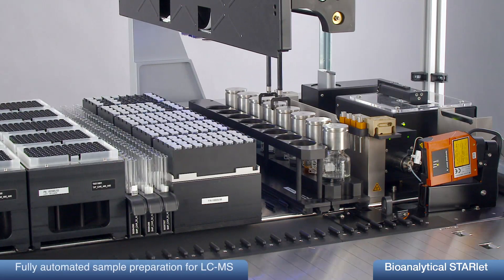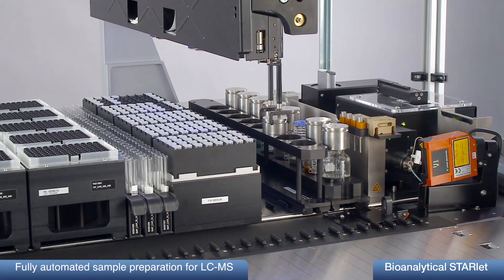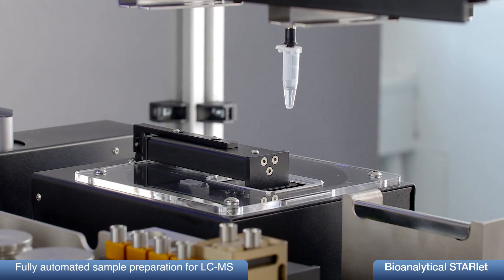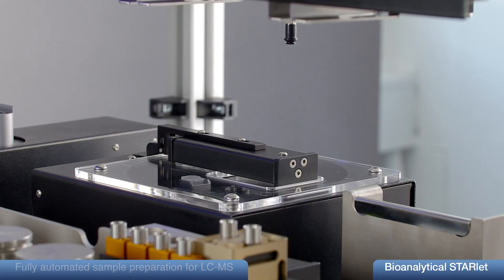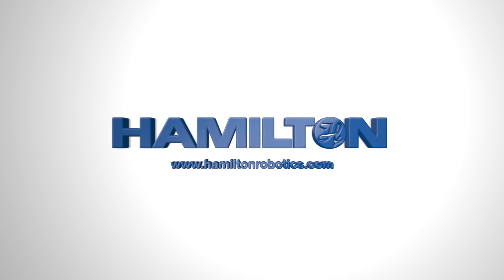Bioanalytical Starlet, developed by ProLab and Hamilton, is a unique solution for automation of sample preparation for mass spectrometry. It supports single-sample processing and is easy to use. Please visit us at HamiltonRobotics.com.